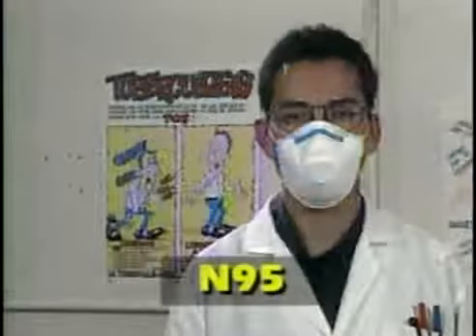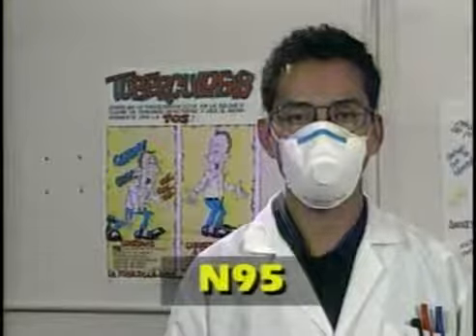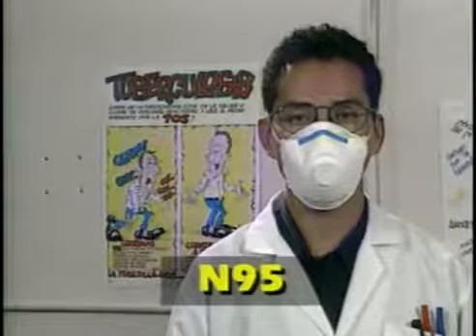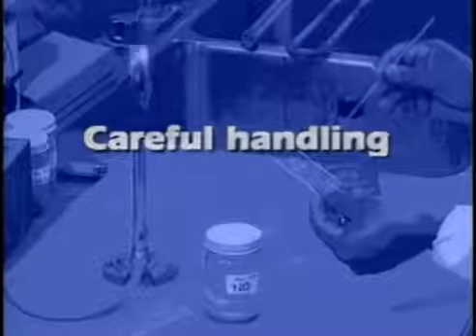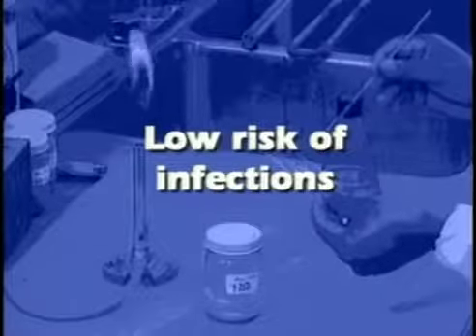Effective respiratory protection, such as an N95 respirator, is expensive and probably unnecessary if the technician uses appropriate technique. Careful handling during smear preparation should produce minimal aerosols. The low risk of infections during these procedures may not justify the cost of respirators and gloves where there may be limited resources for TB control.